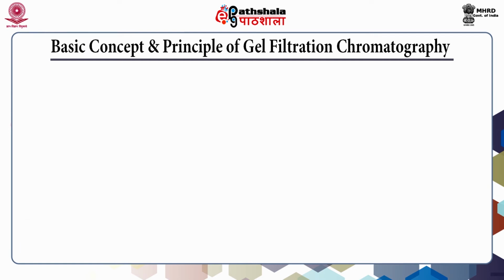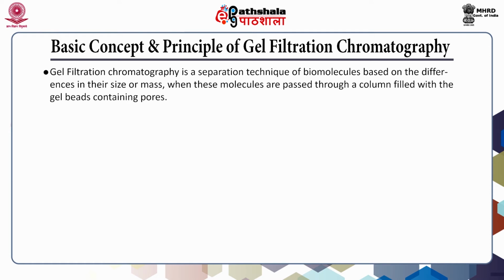Here we are showing the basic concept and principle of gel filtration chromatography. So, what is gel filtration chromatography? Gel filtration chromatography is a separation technique of biomolecules based on the differences in their size or mass when these molecules are passed through a column that is filled with gel beads containing pores.